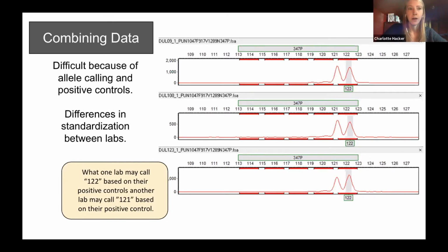In our lab, we use the same 2 positive controls for everything. We know the genotype of those snow leopards forwards and backwards. We can be really confident in whatever allele calls come up for those positive controls, and we can compare all of our experimental samples, the scat samples, the new DNA that we're looking at, to them.